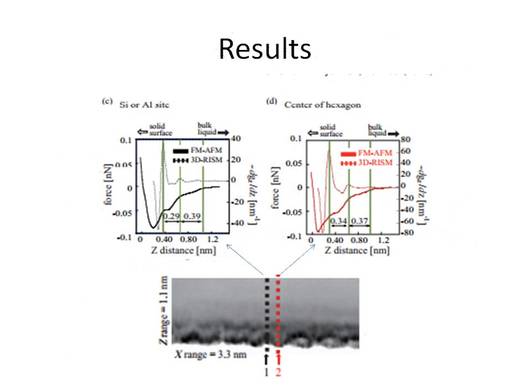Here's some of their results. Each graph shows the force plotted against the distance of the tip that was moved on the surface, and the picture under it is what actually was received from the different laser deflections that they received in their photodiode.